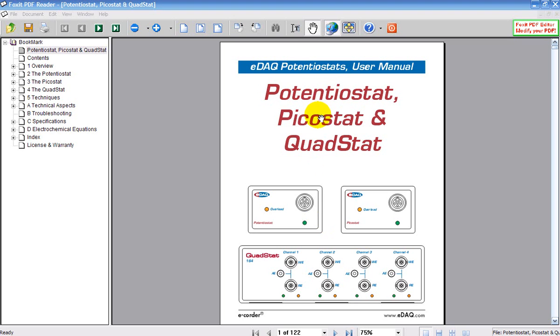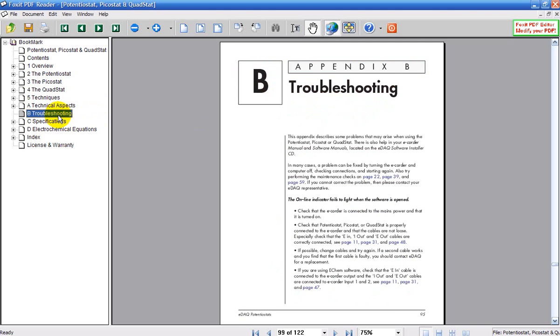This is the potentiostat, picostat and quadstat manual, which will be loaded onto your computer. If you click on troubleshooting, it tells you that there's a maintenance check you can do on page 22.